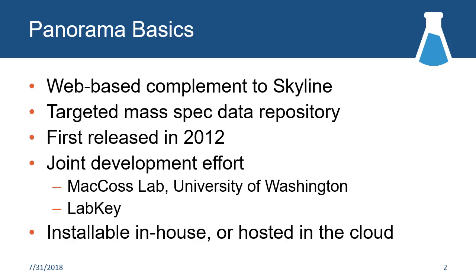So it's reasonably mature at this point. We're about 6 years in, about 4 years behind Skyline in terms of the initial release. And as Mike mentioned, this is a joint development effort. We at LabKey have been doing something called LabKey Server for about 15 years or so. This is a module within that, a little bit more on that in a sec. And we're co-developing that with the MacCoss lab. So we're both taking features depending on what's going to be the most efficient way to get it in there.